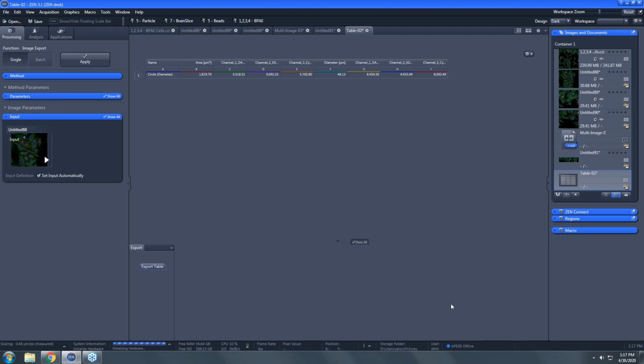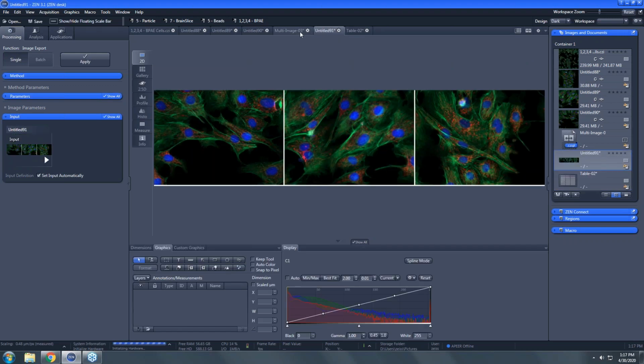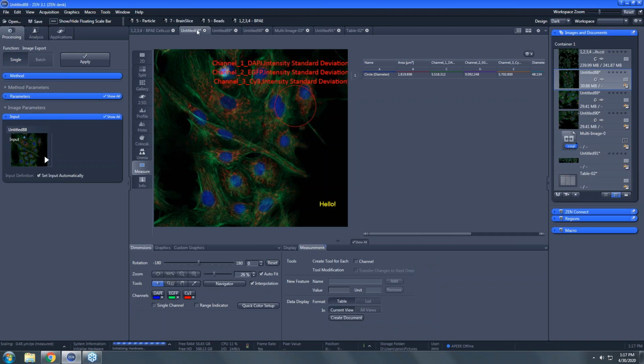All right, good. So we've got some measurements then. A couple of things to point out there. If we go back to the image with multiple annotations, I wanted to mention that if you just click anywhere in that image away from your annotations, Nicole, and use any of the Microsoft shortcuts, Control A will select all of your annotations.